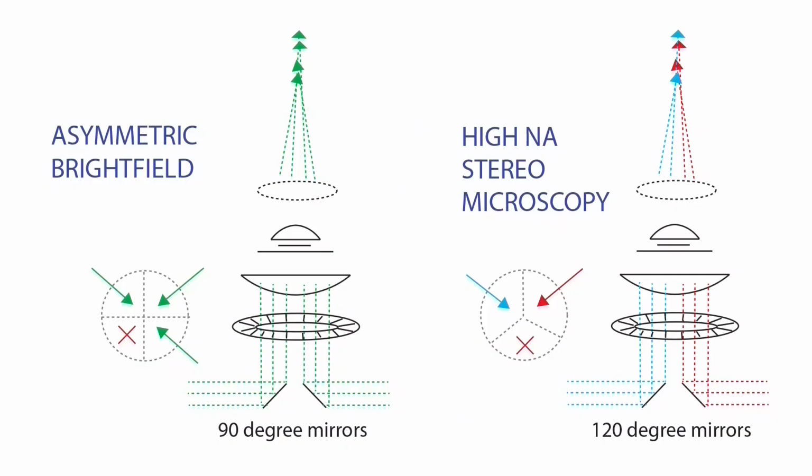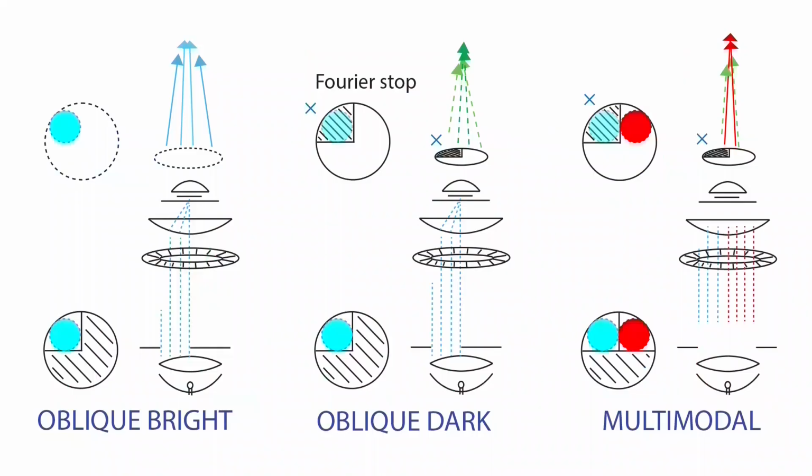Greenberg developed MOBI systems with 3 or 4 white beams to achieve stereo microscopy in high NA microscopes, or to generate asymmetric contrast images by turning off one or more of the sources. Various combinations could be used for asymmetric contrast. The last 2 panels illustrate proposed Fourier modulation methods for internal dark field and for multimodal imaging in white or in contrasting colours.